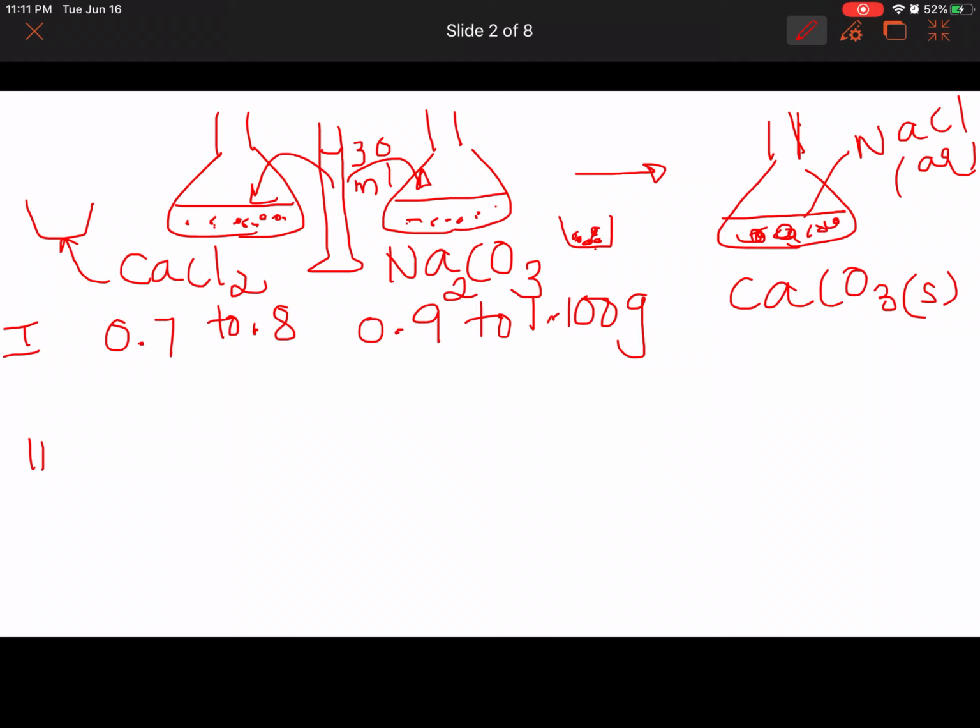Once you make your calcium carbonate, you mix it and let it stand for 15 minutes to make the most solid out of this reaction. And then you're going to go ahead and filter that through vacuum filtration. You will see all this when you are watching the virtual video. So that's your trial 1.